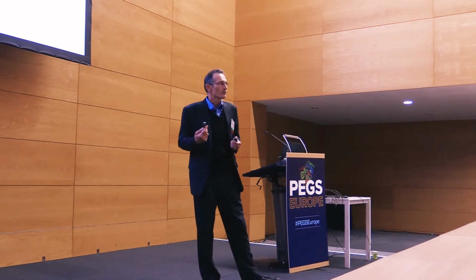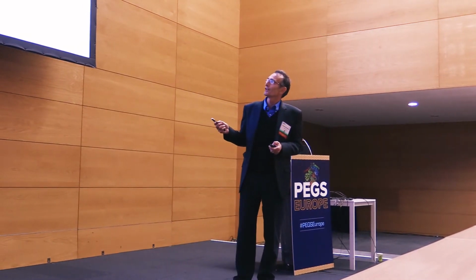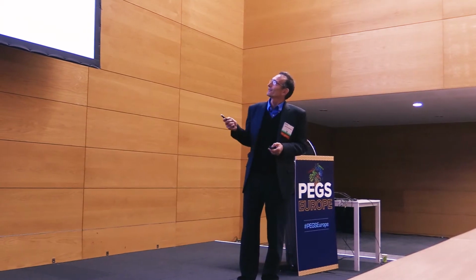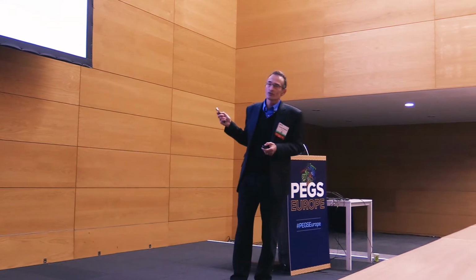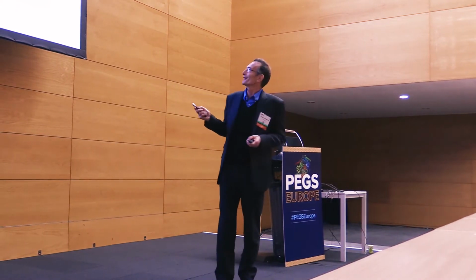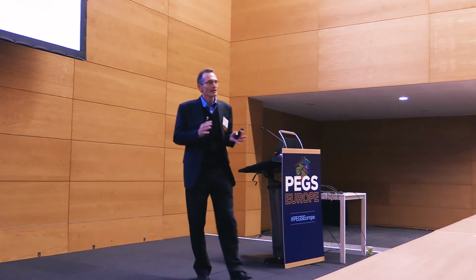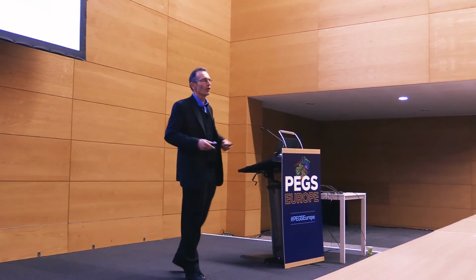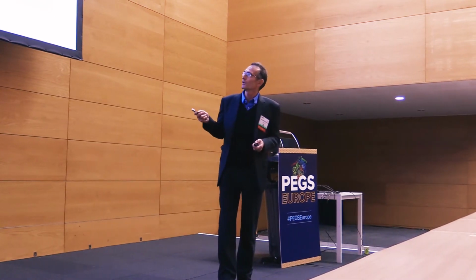And so we all know what a bad therapeutic antibody looks like. Bad pharmacodynamics, bad pharmacokinetics, and difficulty in manufacturing. And the converse of this is a good antibody, which has good pharmacodynamics, has good pharmacokinetics, and is easy to manufacture. So having identified these as the goal, then one thing we want is a good selection platform, which will give us these antibodies with these properties.